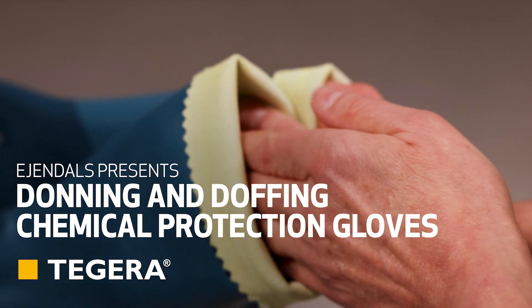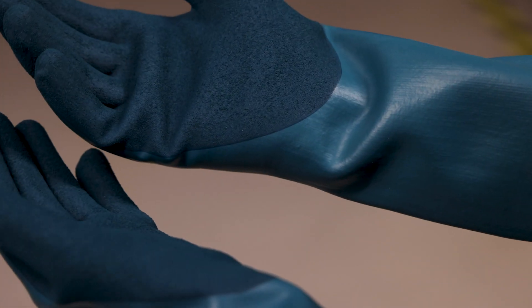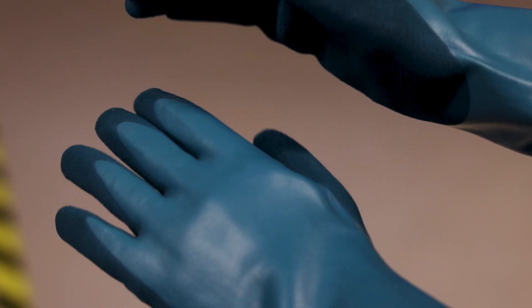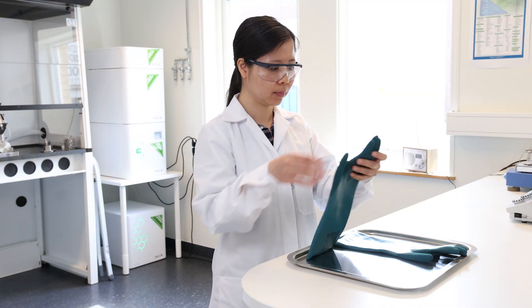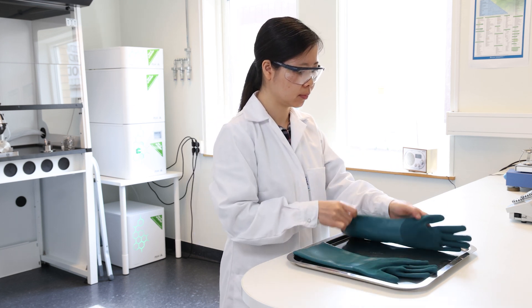How protective gloves should be used. In addition to choosing the right glove with the right material and the right breakthrough time, it's important that the glove is used correctly to provide adequate protection. As a rule, chemical protection gloves are intended for single day use and sometimes for even shorter periods.